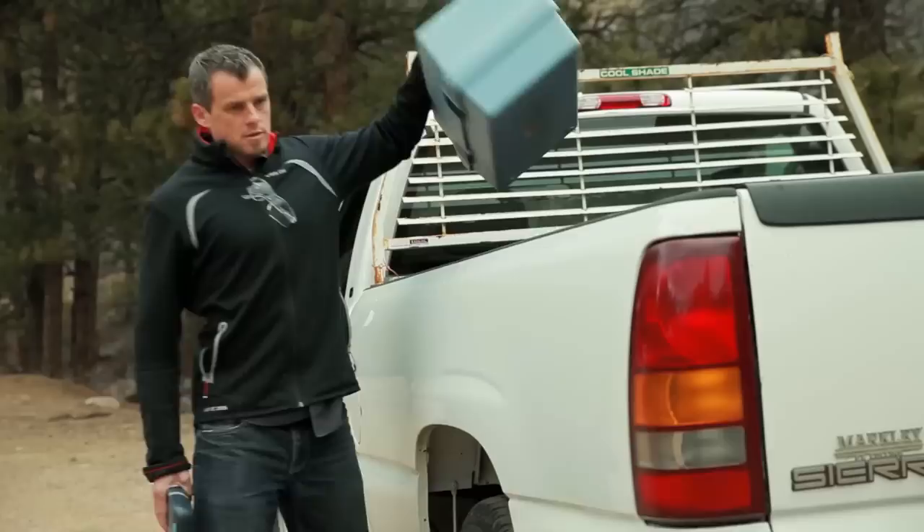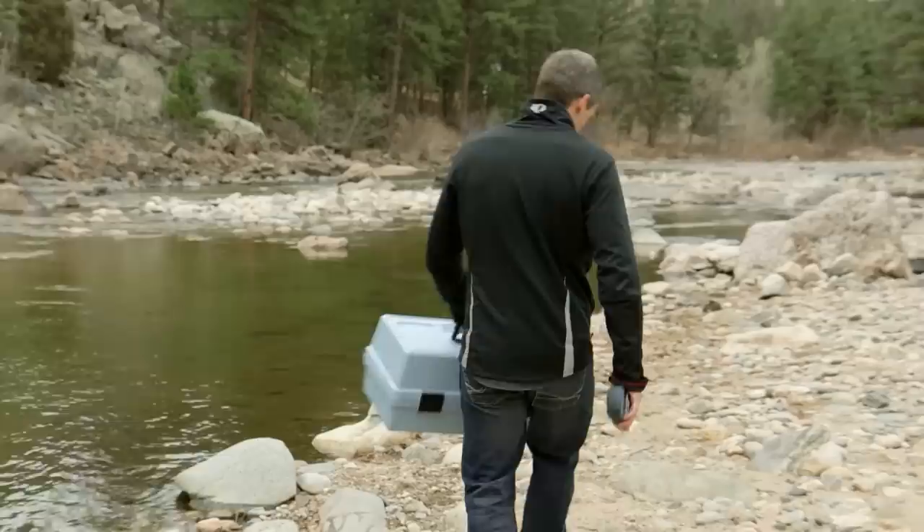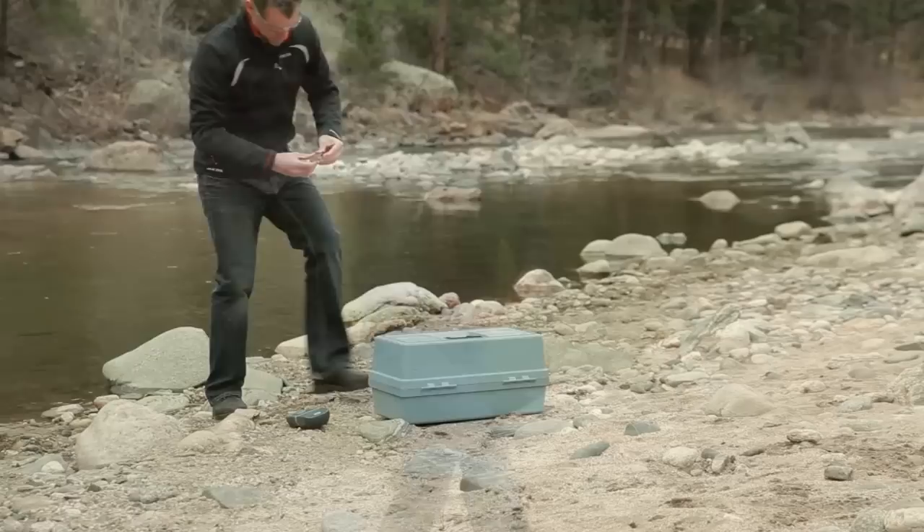Testing in the field means complications: complicated terrain, weather, and testing conditions. There are no lab benches, very few flat surfaces, and just about everywhere you go you run the risk of damaging equipment.